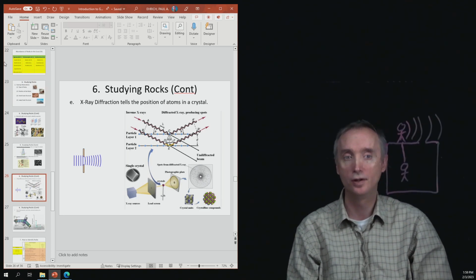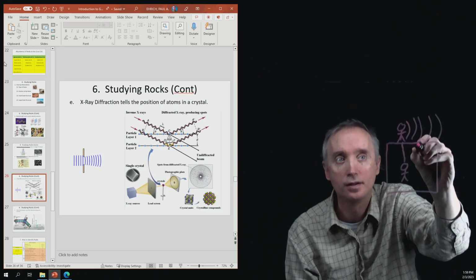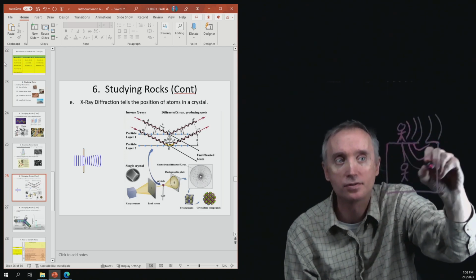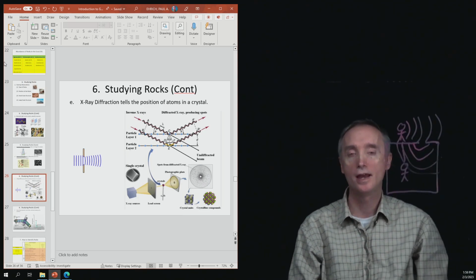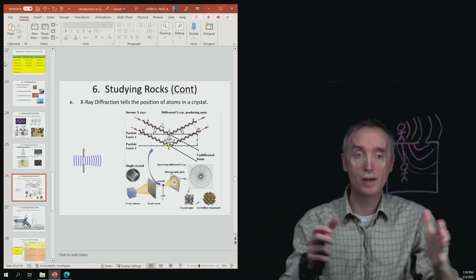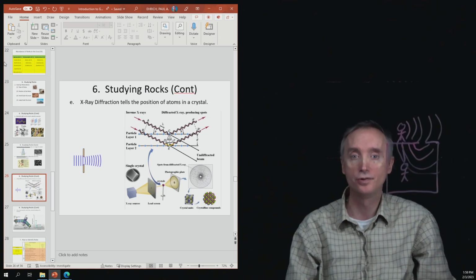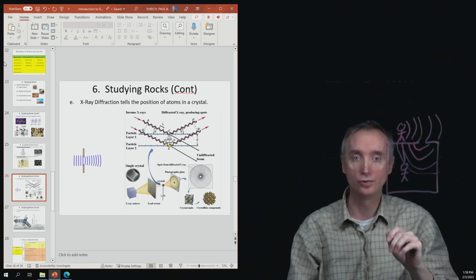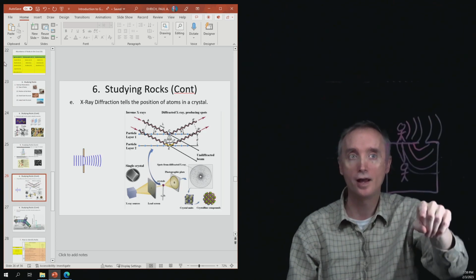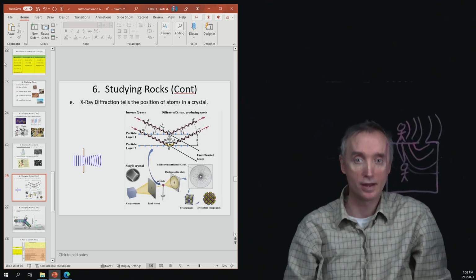But you can hear them because these sound waves, when they encounter the door, they spread out like this, and then they go into the room, and then you can hear the sound waves. So this process by which a wave will expand whenever it encounters an opening like that is going to be called diffraction. It's not just sound. Light will do the same thing. So when light encounters an opening, it will also spread out like that.